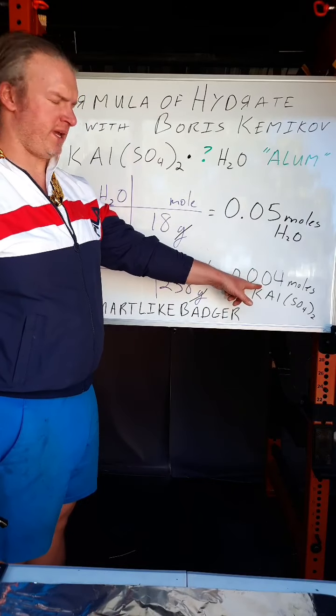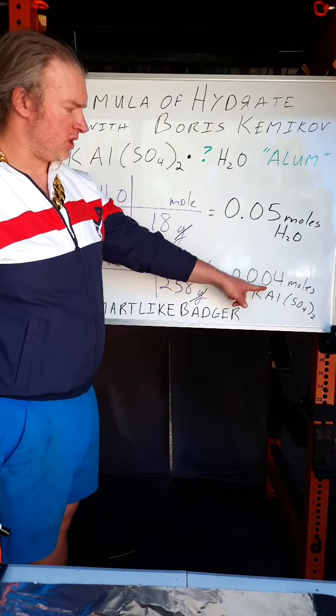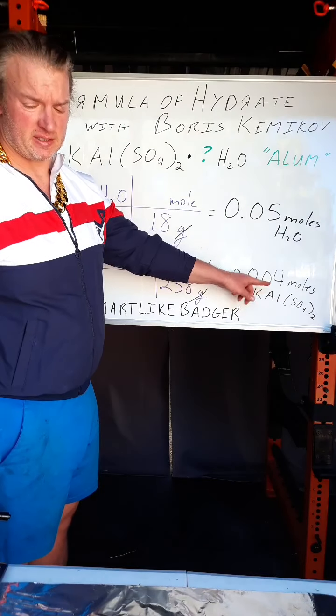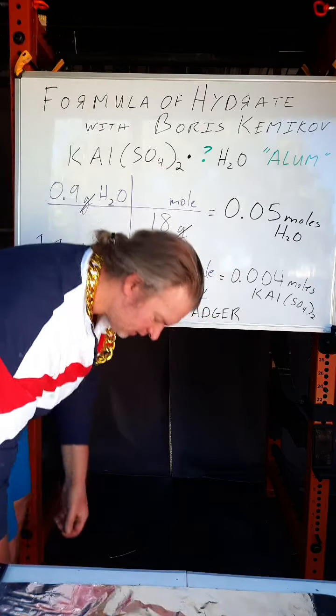Now, what we do with these numbers, we can compare to find out the ratios of how many water molecules were surrounding each of these. Now we can do that comparison with a simple ratio.